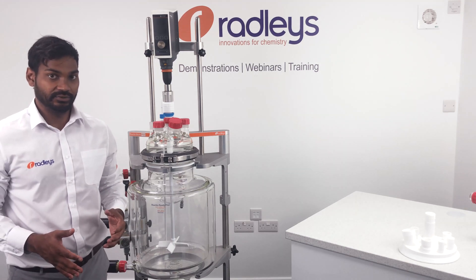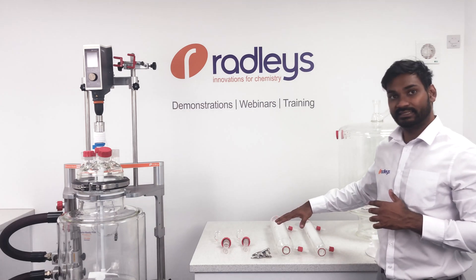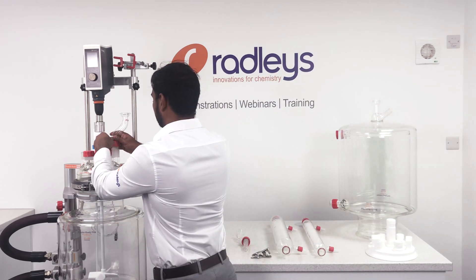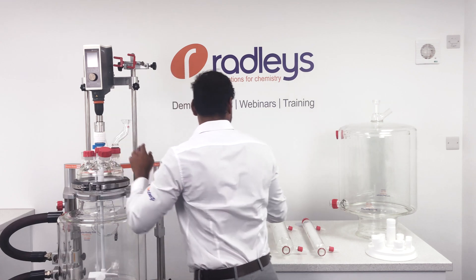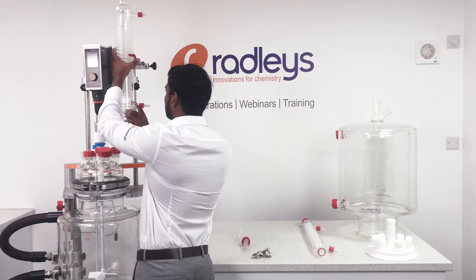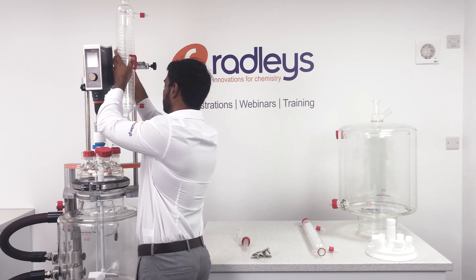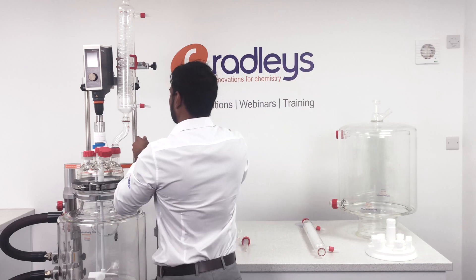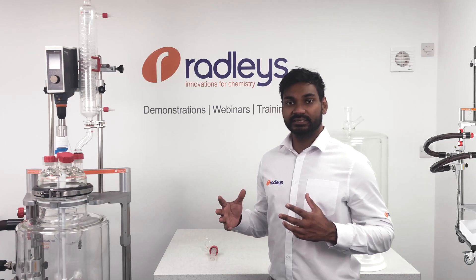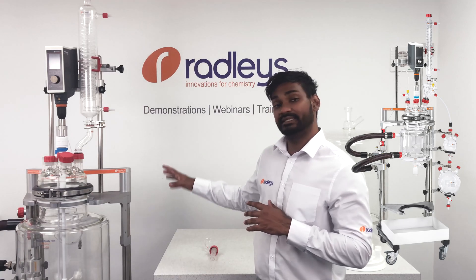Now our system is ready to use. We also have a range of glassware accessories for Reactor Ready Pilot, including new ball-jointing condensers and adapters for easy alignment on the lid. If you need to perform distillations and solvent swaps, we have a reflux divert kit which allows condensed vapours to be diverted into a separate receiving vessel.